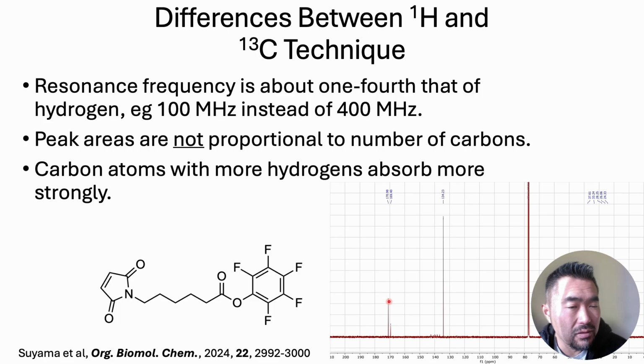But I want you to notice that carbon atoms with no hydrogen on them, like the carbonyl carbons, often have a very small peak, and that's because the protons on a carbon sort of help the carbon to relax better, and so for that reason give a stronger signal. So carbons that do have protons give a decent signal. Carbons with no protons give a horrible signal.